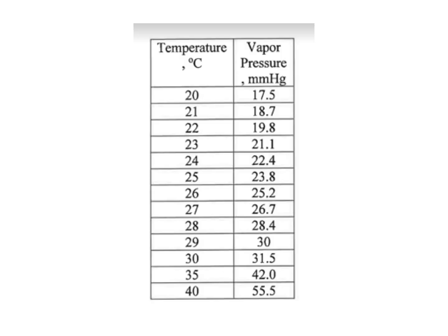We're going to go to this table here, and this I attached to the back of the worksheet. And all we need here is the temperature of the water tank. So it was at 21.2 degrees Celsius. That puts us right about there. So the vapor pressure is 18.7. Now this is in millimeters of mercury, so we've got to keep that in mind. We're going to write this down, 18.7 millimeters.